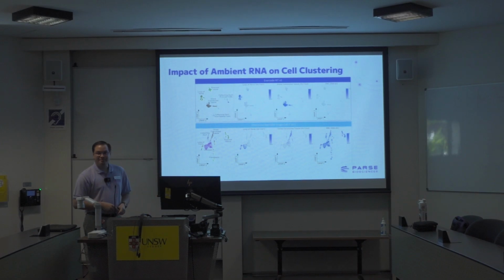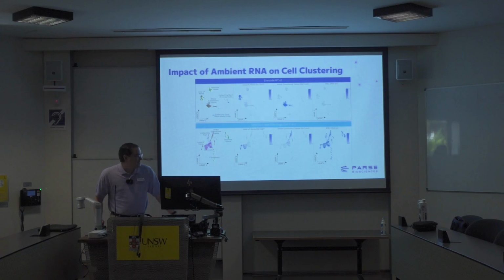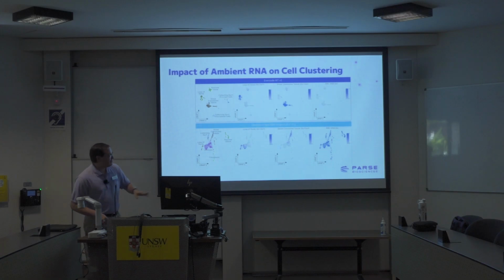And then I showed this to a bioinformatician. And he's like, oh yeah, that's ambient RNA. You want me to clean it up? I'm like, what? I just wasted 6 months of my time on this artifact. And he's like, yeah. I'm like, back to the drawing board. I laugh at it now, and it makes a great story, but it was horrible during my postdoc. So don't waste your time.